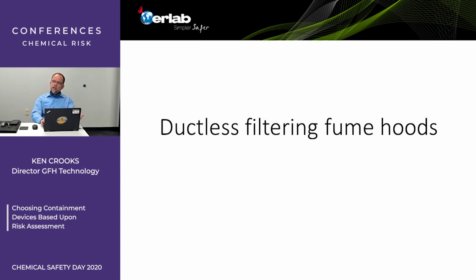So changing to the next type of containment device, again, once you know the risk, you've done the risk assessment, ductless filtering fume hoods. Are these appropriate? Could these be used for your risk? For some things like CMRs and the highly toxic chemicals, no, immediately not. This isn't even considered for those sorts of applications.